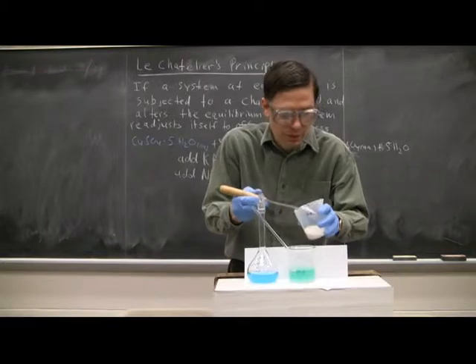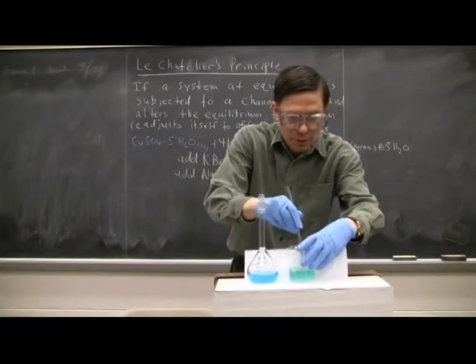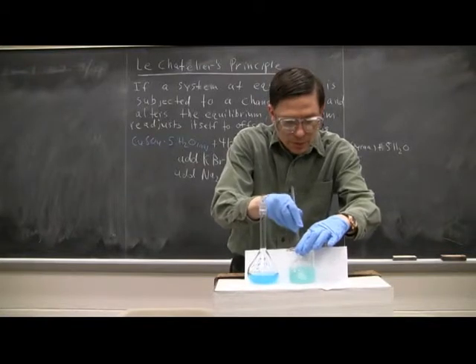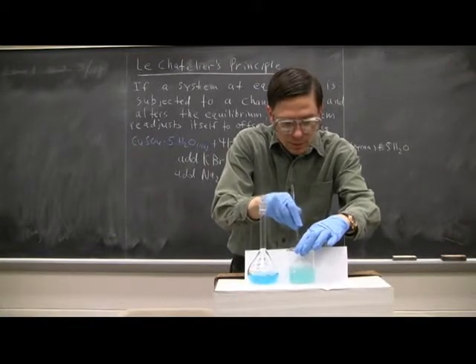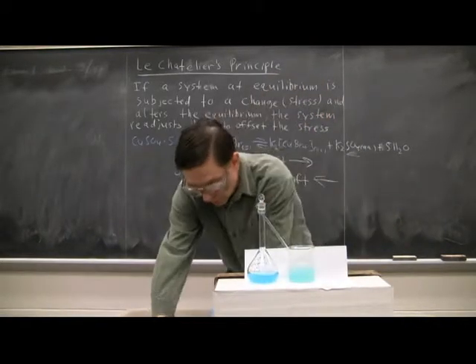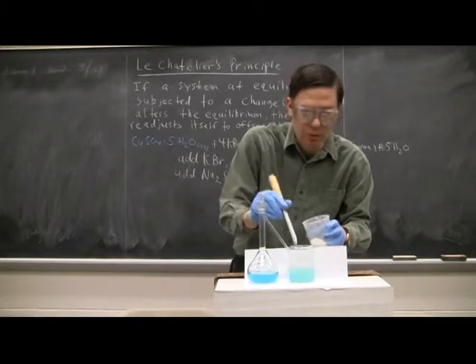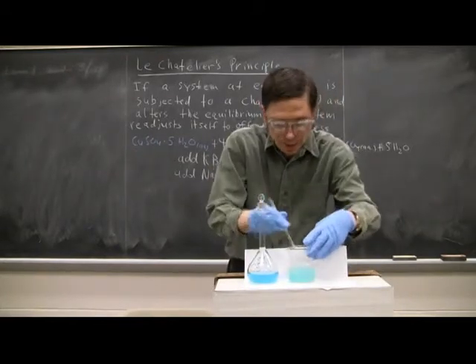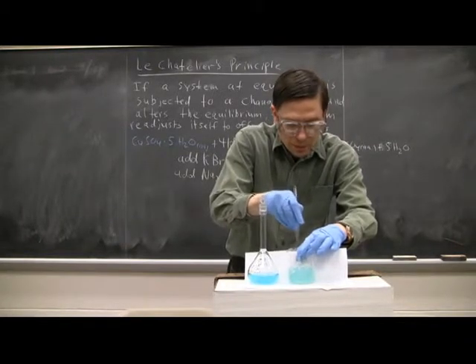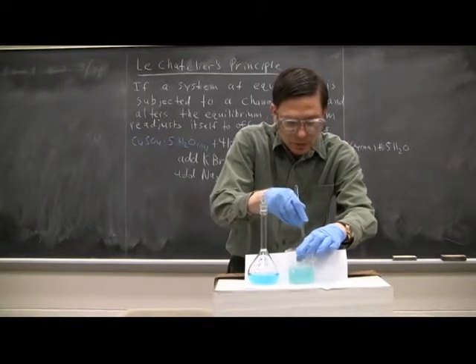Now again, it may not go back to the original color because there's mixtures of several different ions here and there. So it's not going to be perfectly back to the original color. Let me add a little bit more, two more little scoops. And again, you have to do this in a gradual way. I have to make sure that all of this dissolves.